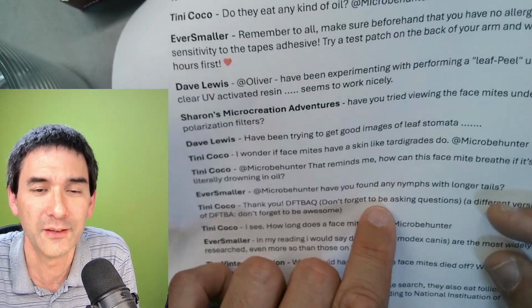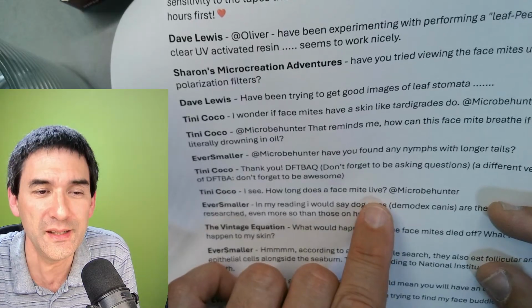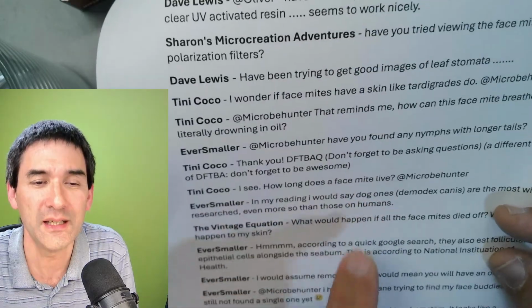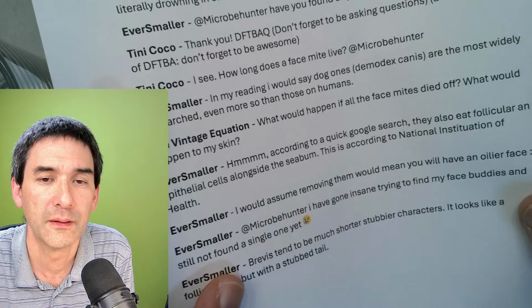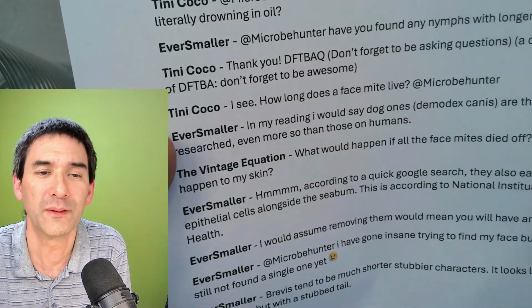Yeah, and don't forget to ask questions. Face mites live 14 days. This has now been researched by Ever Smaller. Demodex canis, yeah, most of these are already addressed. Okay.